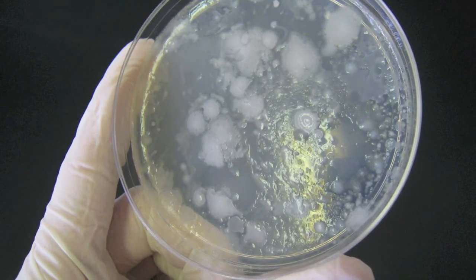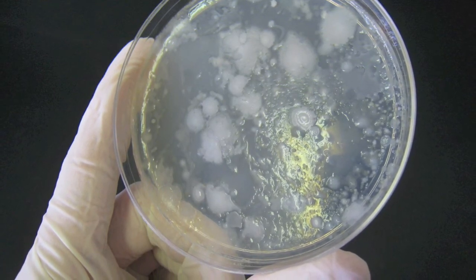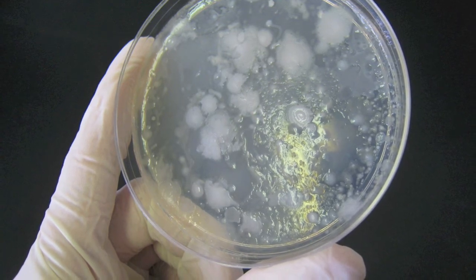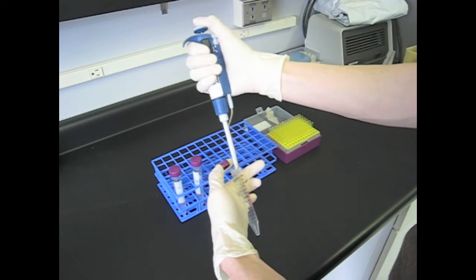This preliminary incubation count grew so many bacteria from the original milk sample after it sat in the 12 degrees Celsius fridge that you couldn't even tell the colonies apart when it was plated and grown. In this case, dilution should be used to separate the bacteria out and make them more countable.